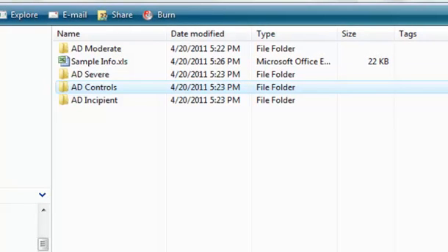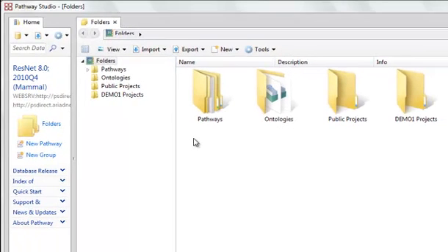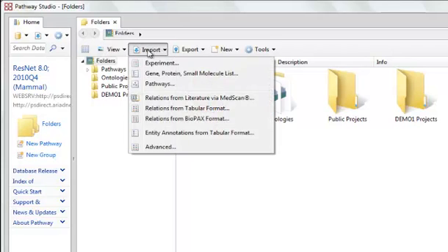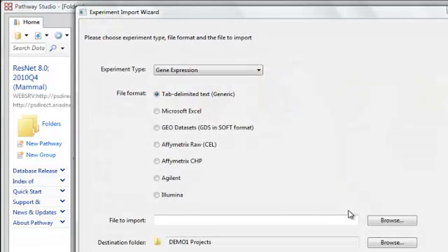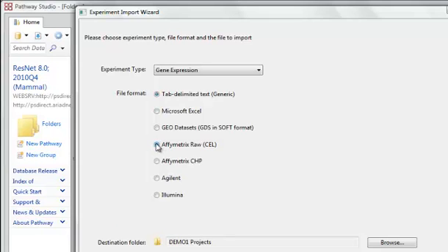So now that my data is prepared, I'm ready to start in Pathway Studio. I'll go to import, experiment, and then I'll pick cell files because these are Affymetrix HGU-133A chips, which is a very common chip.